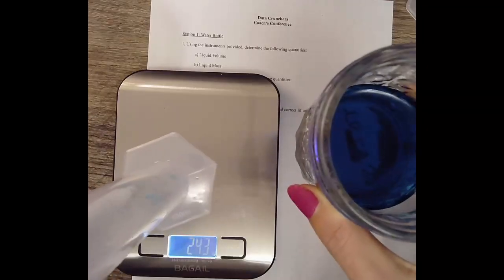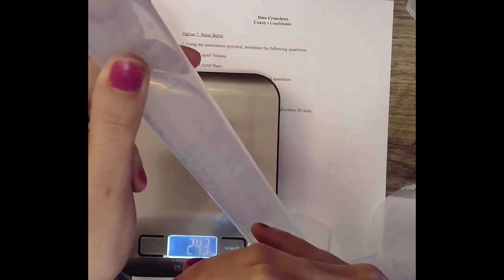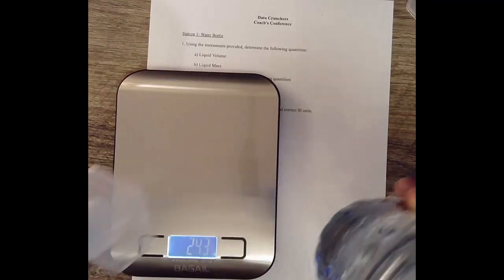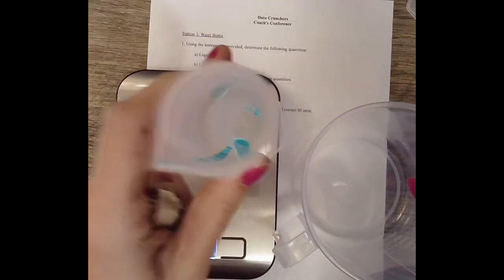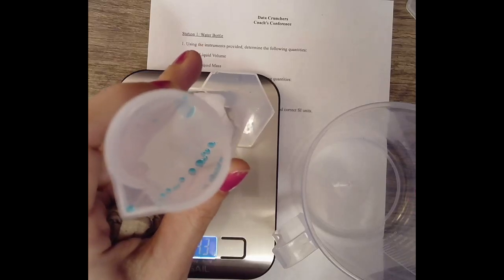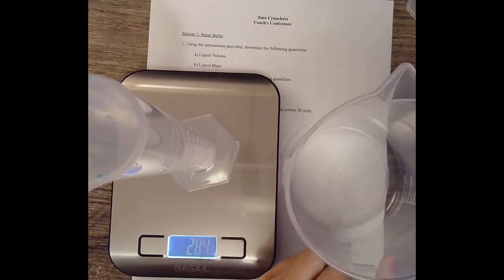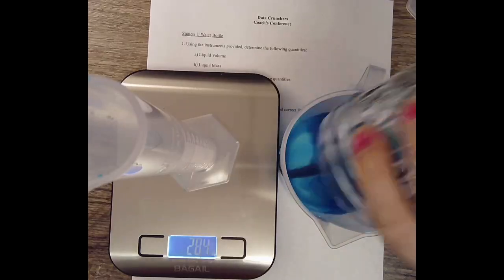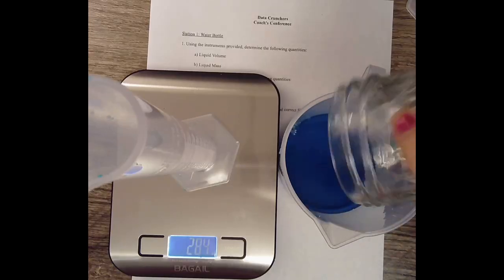But anyway, if I'm trying to pour this jar into this graduated cylinder, which is more used for measuring liquids, because it's more accurate than a beaker. So don't use your beaker to measure your liquids, just for holding them. It would be really hard, and you've already seen, I've actually done a video before this and I've poured it all over the place. So don't do that. You pour your liquid into your beaker, and I'm actually going to pour it into a smaller one because I don't need that large beaker. That's nice and easy and I'm not spilling anything, contaminating my table, my paper, or myself.